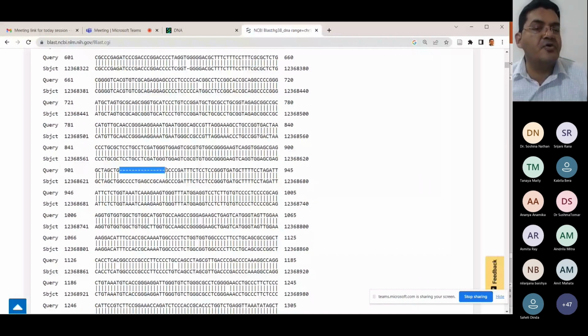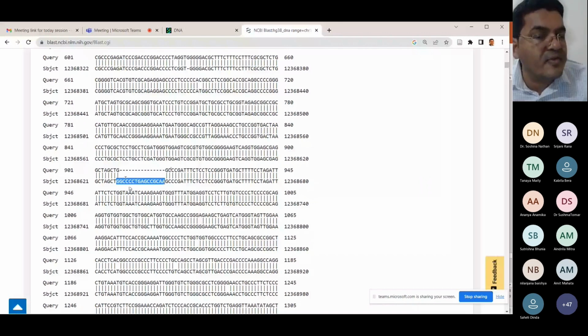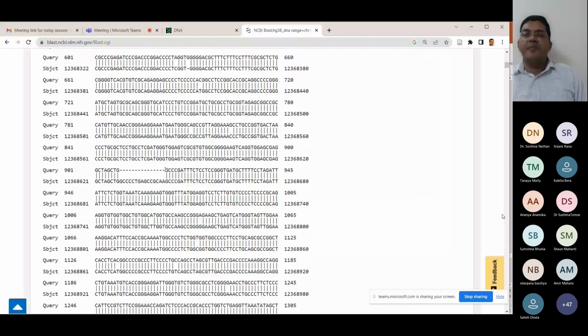That much we can say for sure. Whether it came in chimpanzee after the humans diverged or whether it was lost in humans after divergence is something that you cannot say from this alignment. We're looking at homology. We're looking at the orthologous locus in chimpanzee.